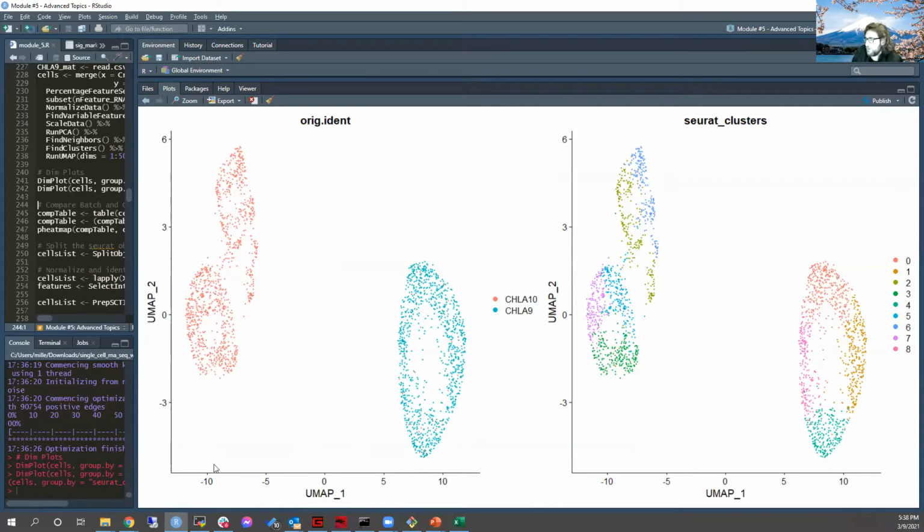The other thing to notice is that it's not just the UMAP. The clusters seem to occur entirely independently by cell line. So even the clusters, which are a more robust way of finding similarities and differences between cells, don't seem to be able to recognize these two groups as at all similar to each other.